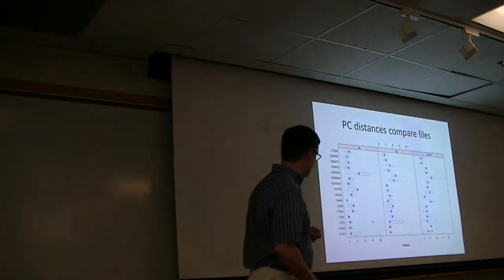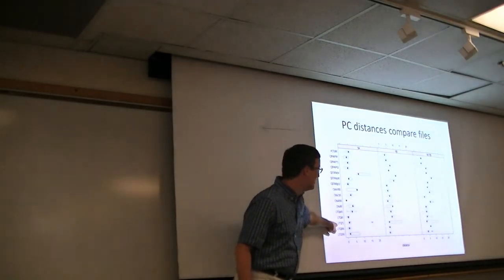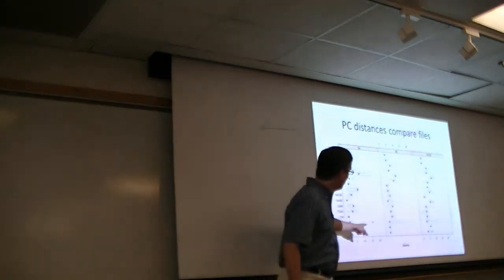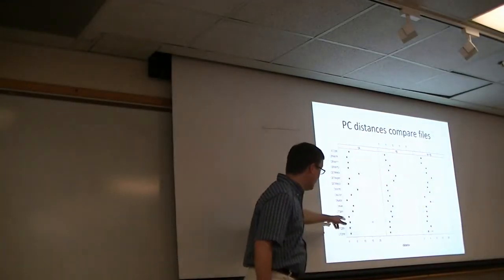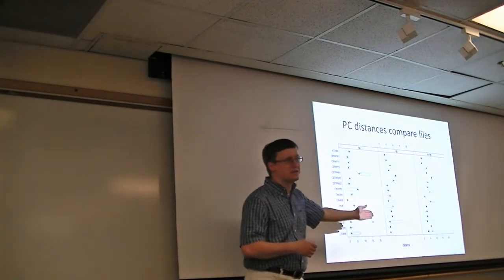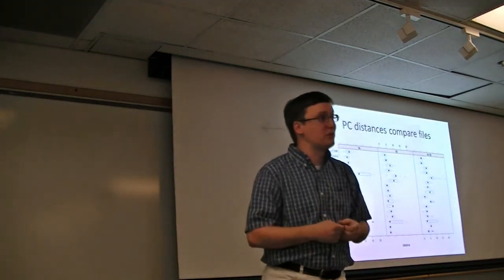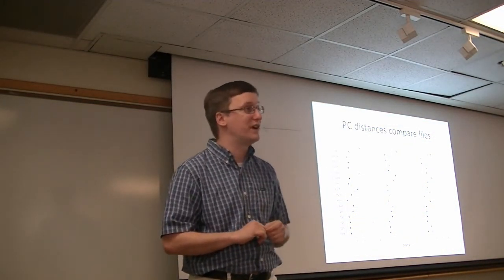But look at this instrument down here, LTQ at site 73. This LTQ is a curious one, because we've got a whole bunch of distances right up here that are way up high, but most of them are quite low. What we found was that if you look at these distances off to the right, those are all associated with one particular file that always produced high distances compared to any other file. So, in general, the experiments produced by LTQ at 73 had great comparability, but they had this one that was just way out on a tangent. So that's how you can spot an outlier, by doing these distances within principal component space from QC metrics. And these are not dependent upon which identifications you produce from these files.